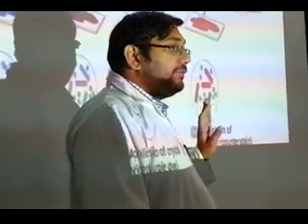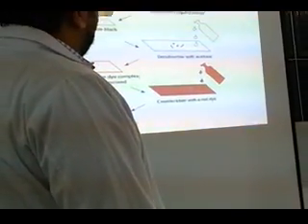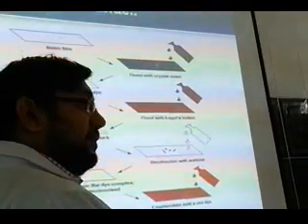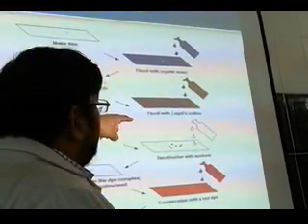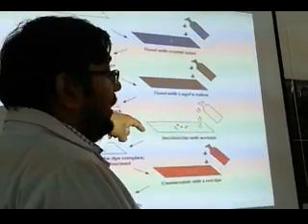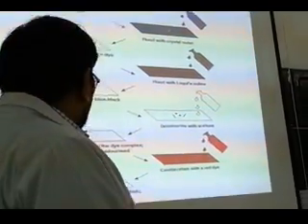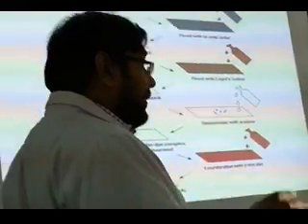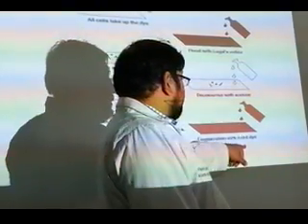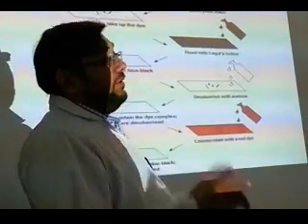You got it? Okay. Once more, simple. You make the smear, you put crystal violet. 1 minute, wash. All cells take up the dye. You put Gram's iodine, all cells appear blue-black. Then you decolorize with acetone. Gram-positive retain the color. Gram-negative are decolorized. And when you put the counterstain, meaning the second stain, that is red color, gram-positive stay blue-black and gram-negative appear red.